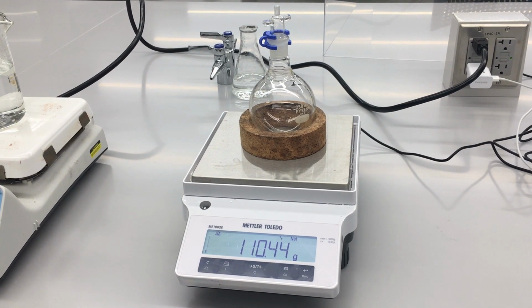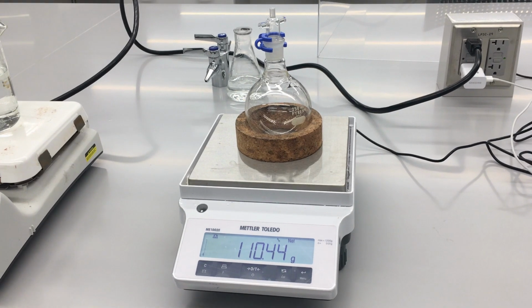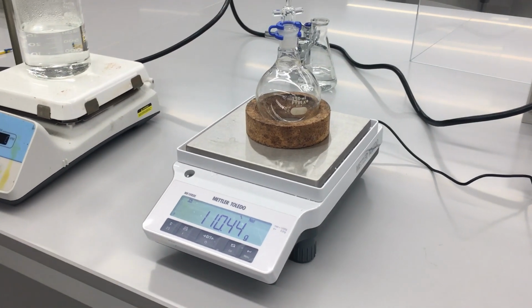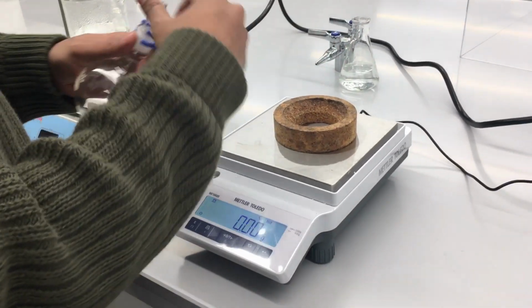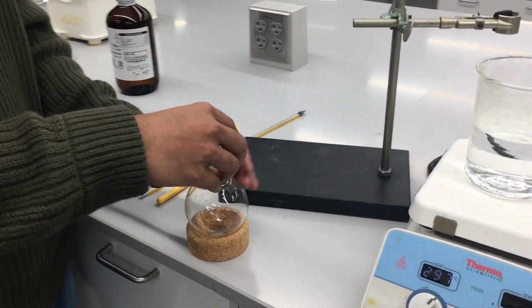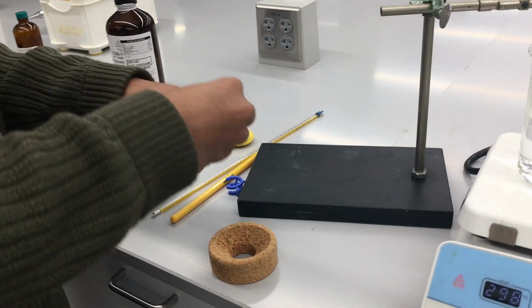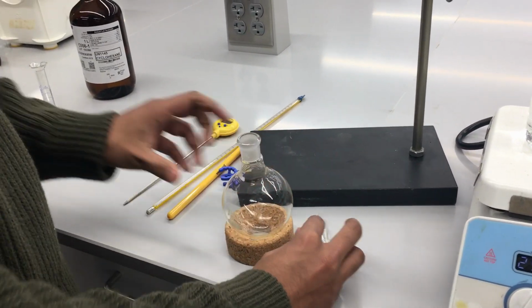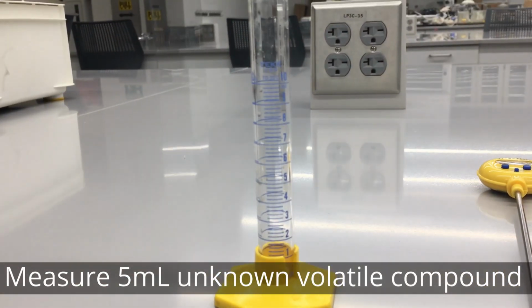This will allow us to figure out what the weight of the glassware is. So you can go ahead and record that right now in grams. Now, notice how I just recorded the glassware itself, not that little stand that it was on. This is important because when I weigh the glassware plus the compound, I'll be able to subtract the two to figure out the mass of the compound.